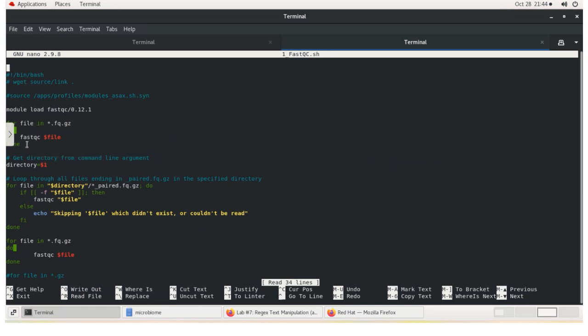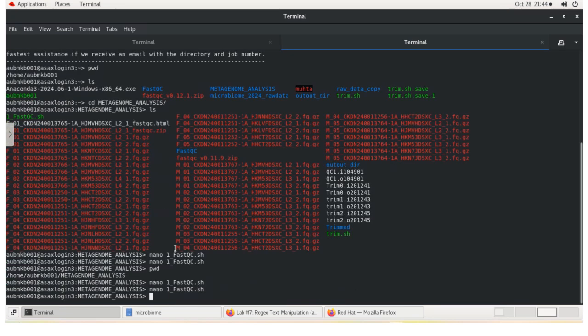So if you want, you can also put a printing statement there, like okay, if it's done or not, if the file exists or not, something like that. So I'll be exiting my command line now, and I will just give to my command line. So once I'm in my command line, now I have set up my script. Now I can run the script.